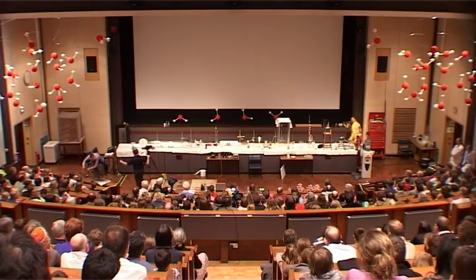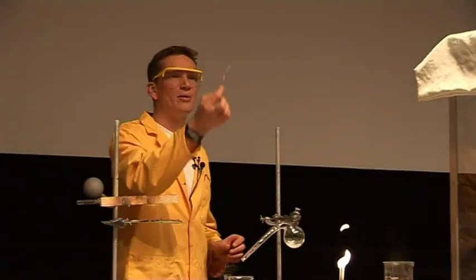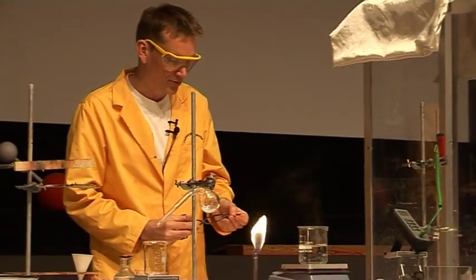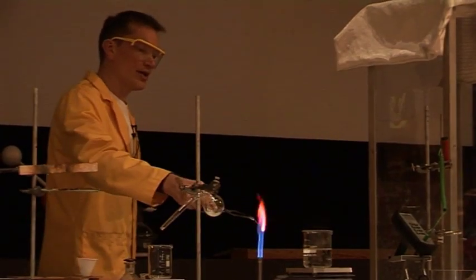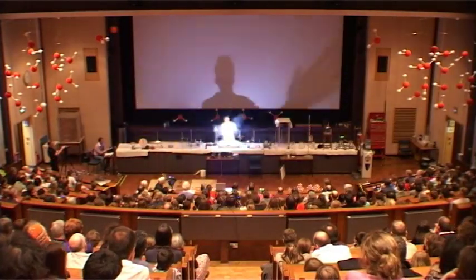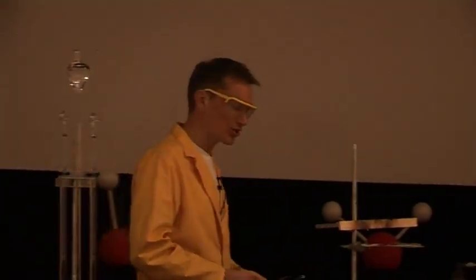Now, I have another reaction that I'm going to show you, and this one involves magnesium. Now, you may have seen magnesium before. Magnesium is a metal, so this is some magnesium ribbon, and, well, it burns with a very bright white flame, as you may already know. So I'm going to use the Bunsen burner here to light the magnesium, and you can see the intense white flame from this and some white smoke coming out here due to the interaction of the magnesium as it's burning with the oxygen in the air, forming magnesium oxide.